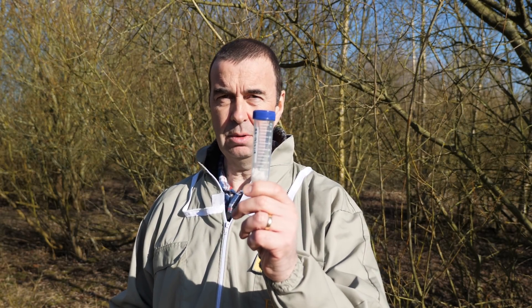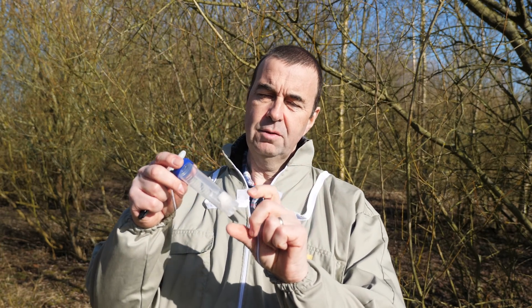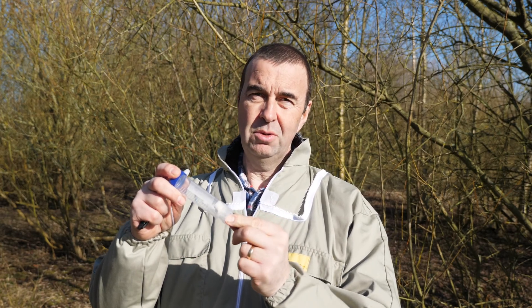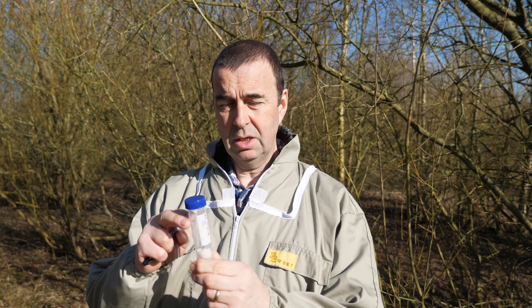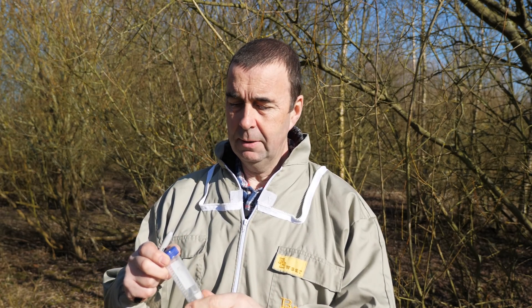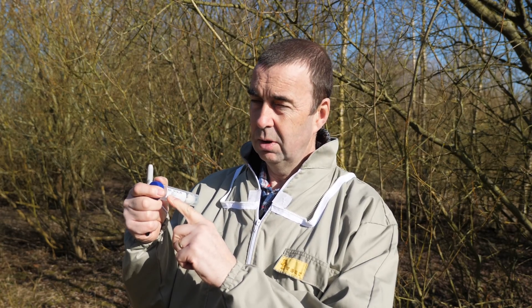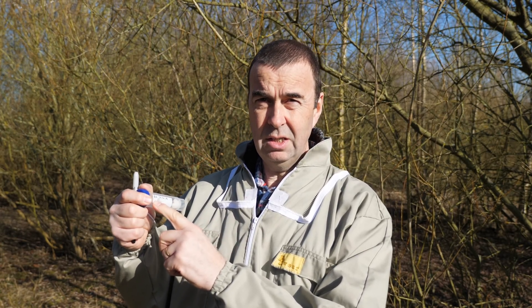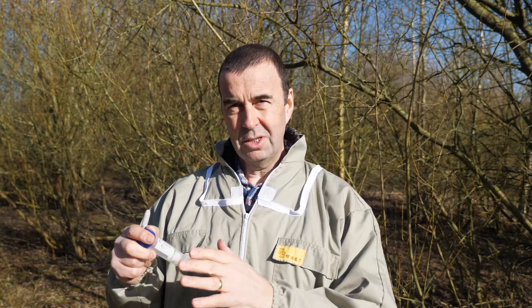I'm now ready to take samples. I've got my sample containers already prepared — inside each one is a small piece of tissue and about two mils of ethyl acetate, which will kill the sample of bees I put in there very rapidly. I've already marked up each tube with the apiary identifier and today's date, and as we get to each individual hive I'll mark it up with the hive identifier so we know exactly where it came from.